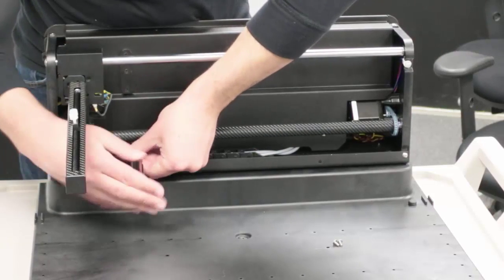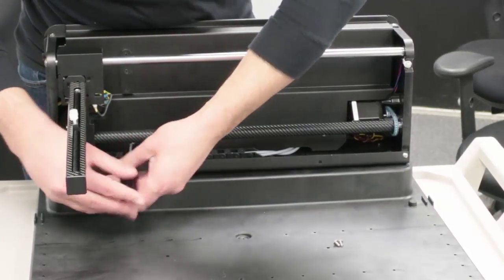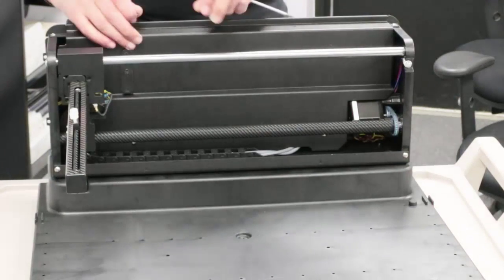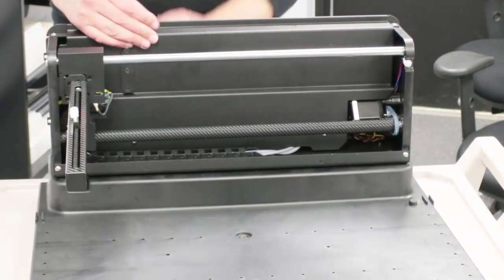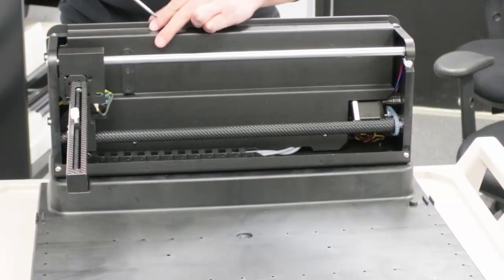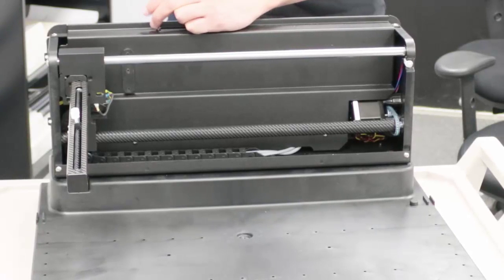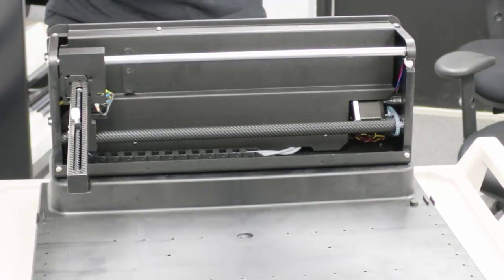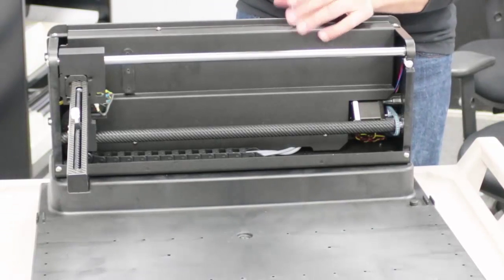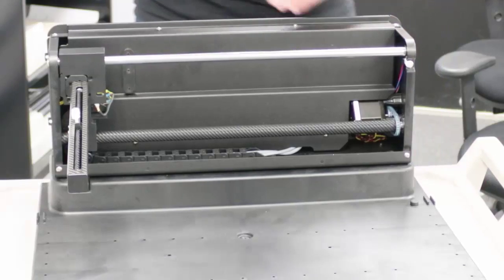Then place the spill tray. Make another pass to tighten the screws.